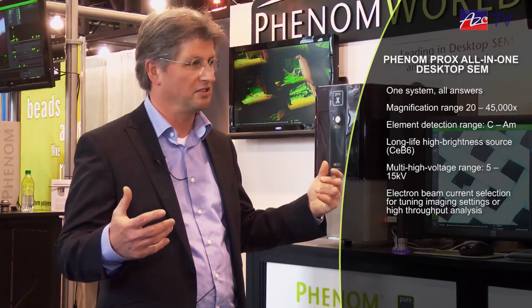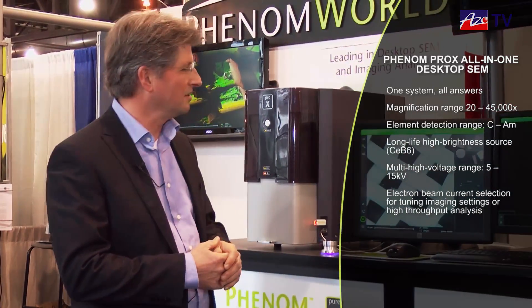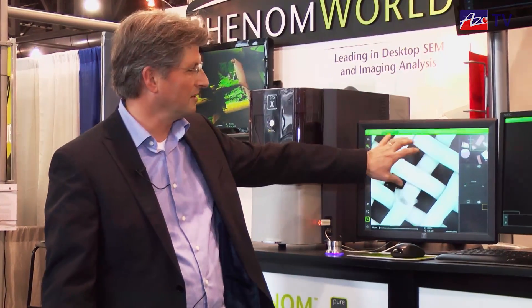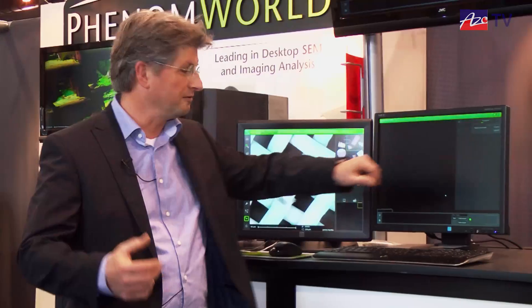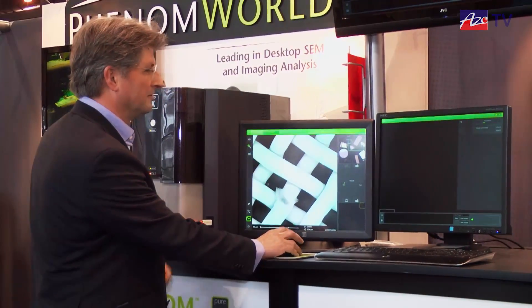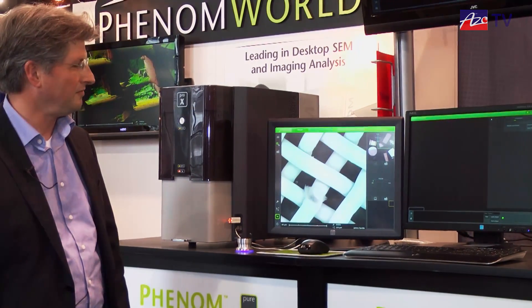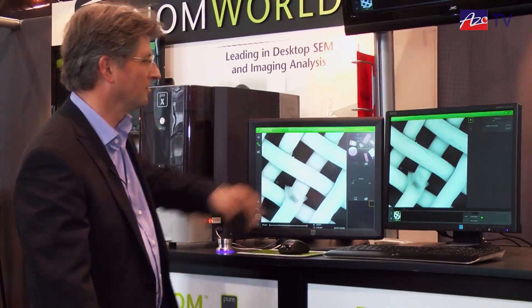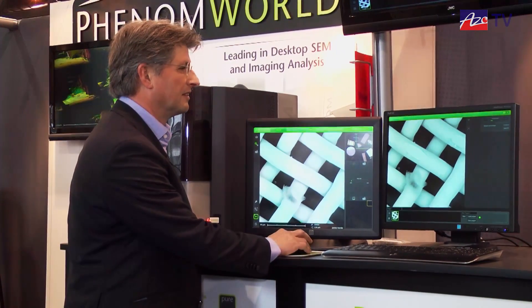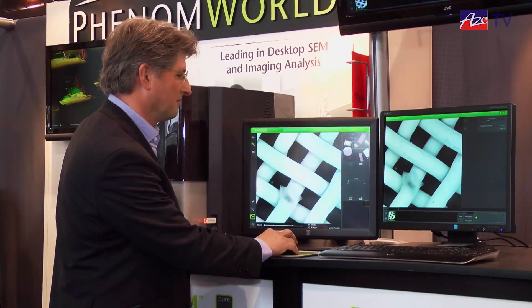This is about the amount of time that it would take. What we have added in the last year is elemental analysis. Over here you see what your specimen looks like, and over here you can actually see what it's made of. We take this information and bring it over to the next screen. The image is now copied, and now we are going to look at what it's made of.